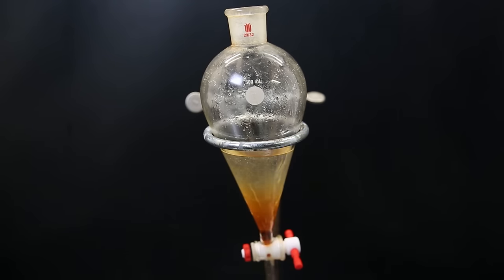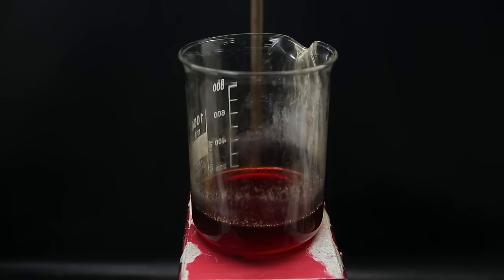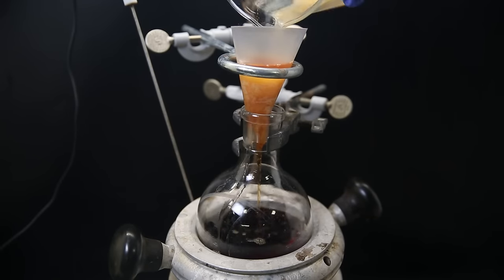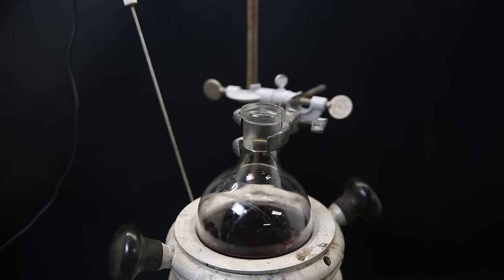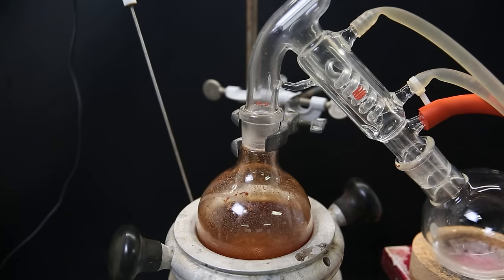I take the washed DCM layer and dry it with some anhydrous sodium sulfate. I then filter it all through some cotton into a flask. I wash the filter and beaker once with some more DCM. I then remove all of the DCM with short path distillation under a mild vacuum, and I am left with a brown orange solid as the product.